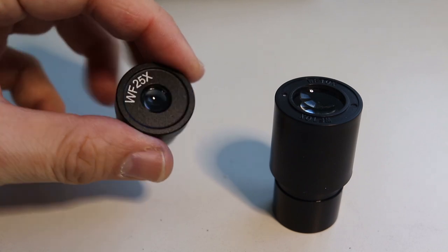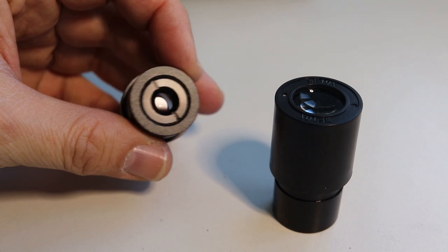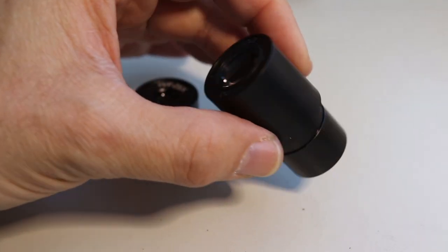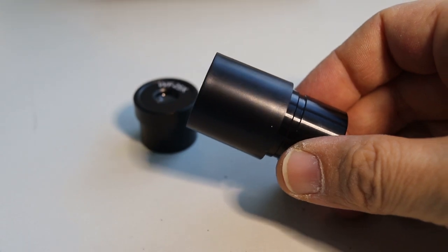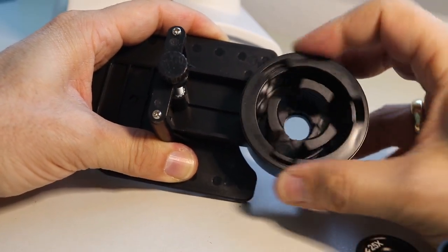There is a 25 times eyepiece, and there is also a 10 times eyepiece. The 25 times eyepiece is made fully of metal. It's relatively heavy. However, the 10 times eyepiece has the front part, the outer covering, in plastic, while the barrel itself is metal. This is now the mobile phone adapter.